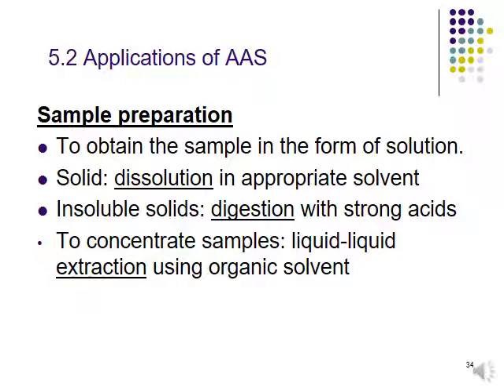For insoluble solids, what you can do is digest with strong acid. You can use aqua regia. You can use HF as a very strong acid. And next is to concentrate samples. You can simply concentrate your samples using liquid-liquid extraction.